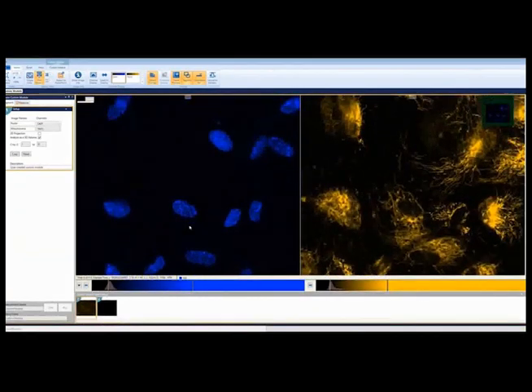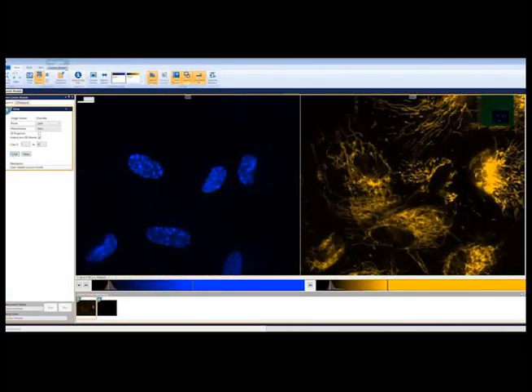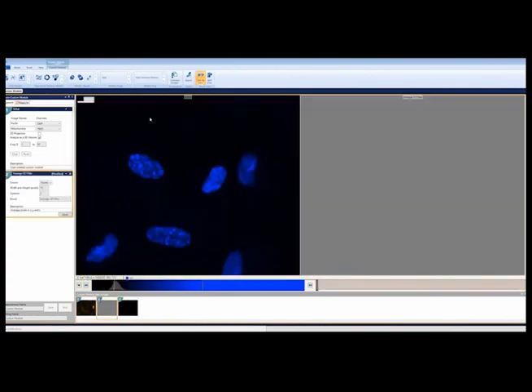So let's look at the first part of our module, finding nuclei. To do this, we will segment entirely in 3 dimensions. To begin, let's look at the DAPI source image. DAPI can be quite textured, especially with confocal source images. So to ensure that we segment the image well, we will first use a 3D average filter to smooth out the sample.